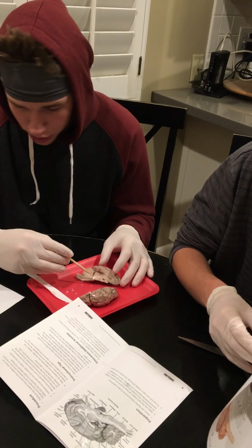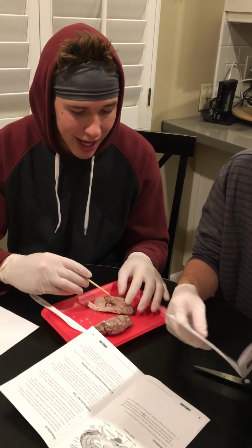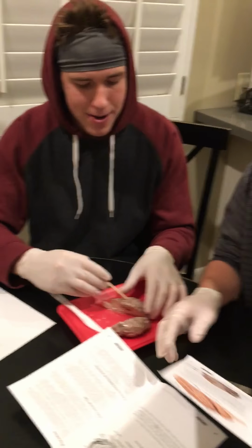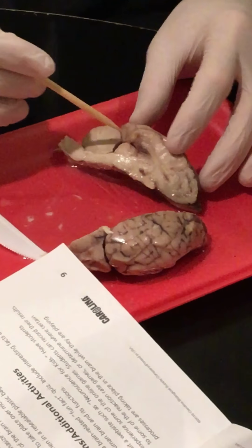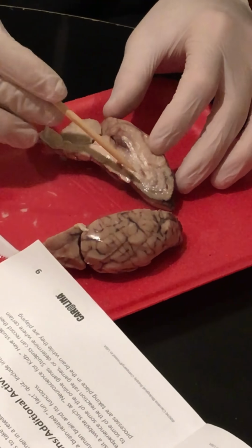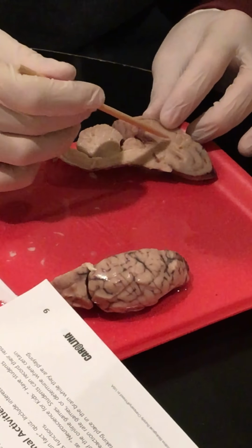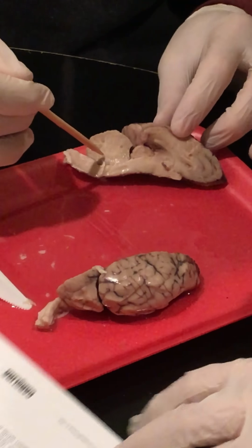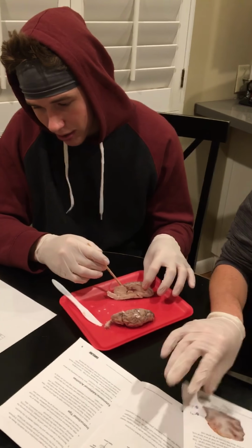Also, white matter and gray matter. Gray matter is on the outside. You'll see it right there. It's a darker layer, and then your white matter is on the inside, lighter. So that's how you can tell the difference between white matter and gray matter.